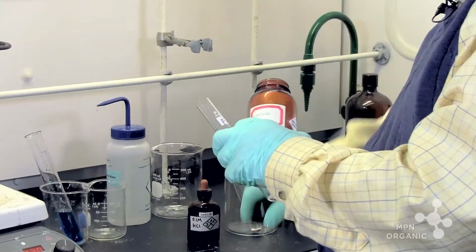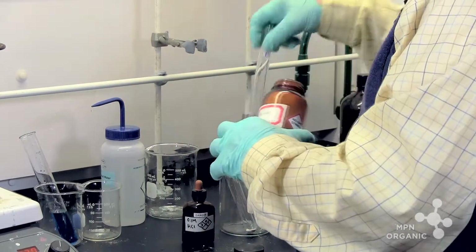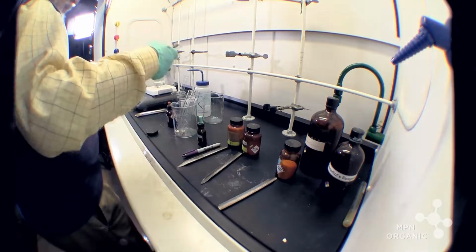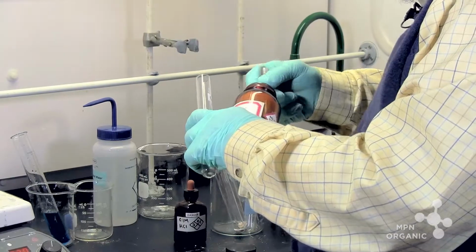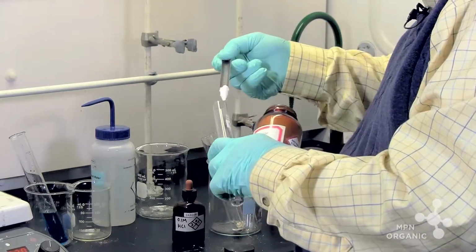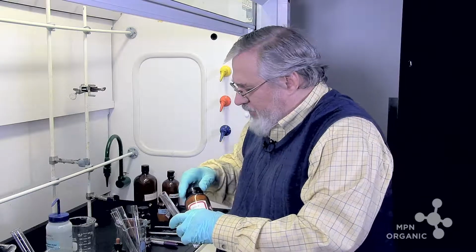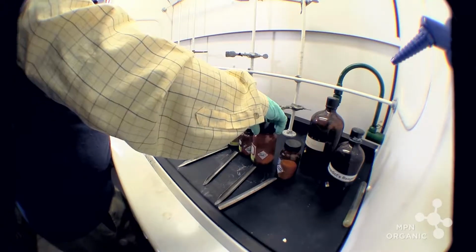Lactose. You're familiar with lactose because you've heard of lactose-free milk and such things. It goes in there. This isn't quite as water soluble, as we'll see.